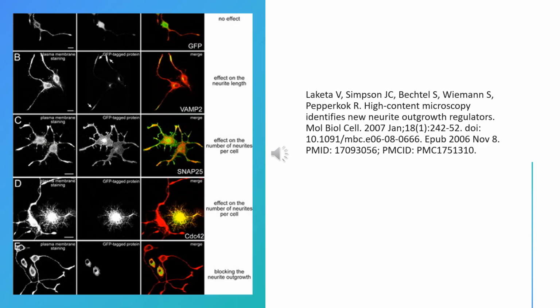So for my first image, it is showing control proteins affecting neurite outgrowth when overexpressed in PC12 cells, which were then transfected with GFP-tagged ORFs. After incubation, they were stimulated with NGF for 24 hours and fixed and stained with Alexa 647 to highlight the outline of the cells.